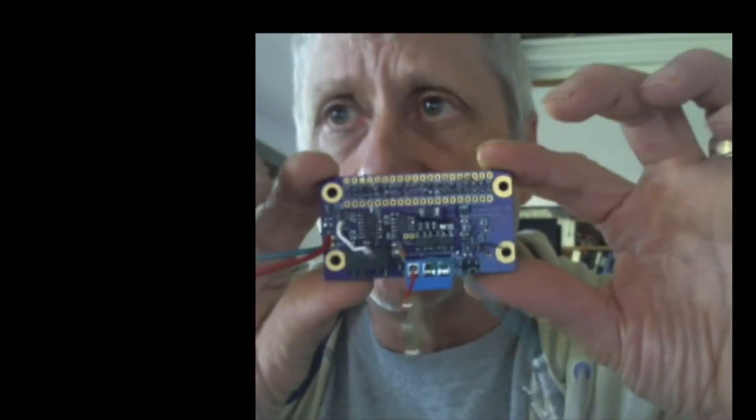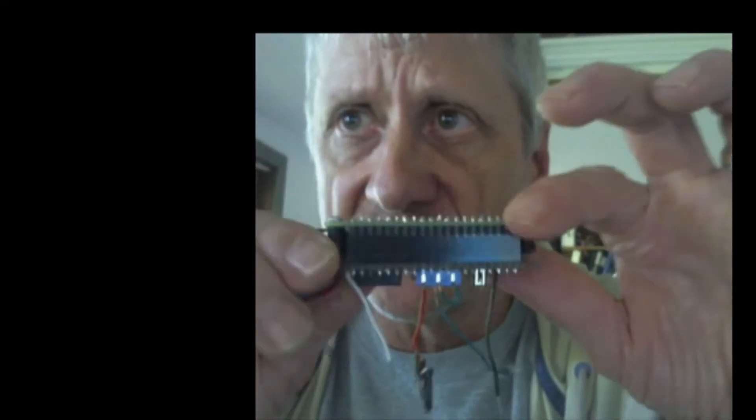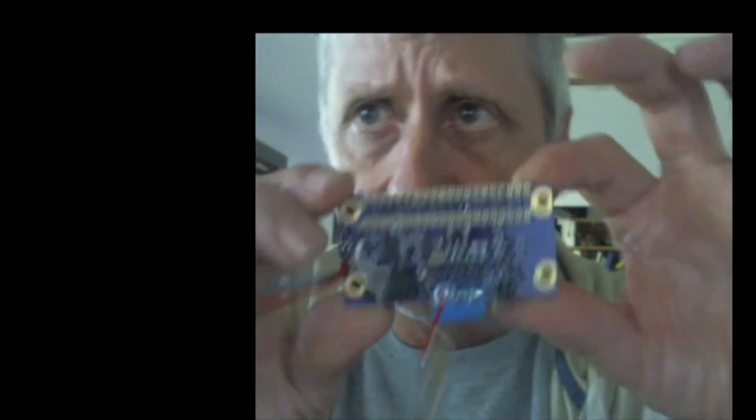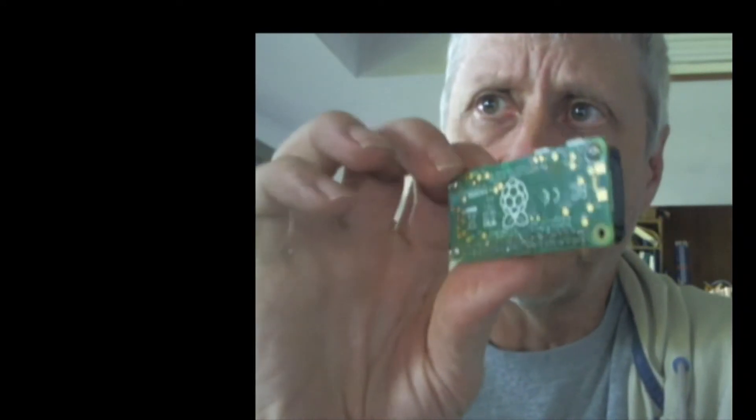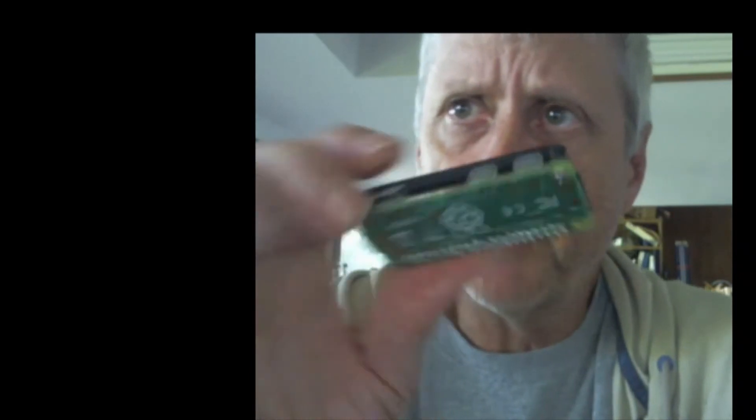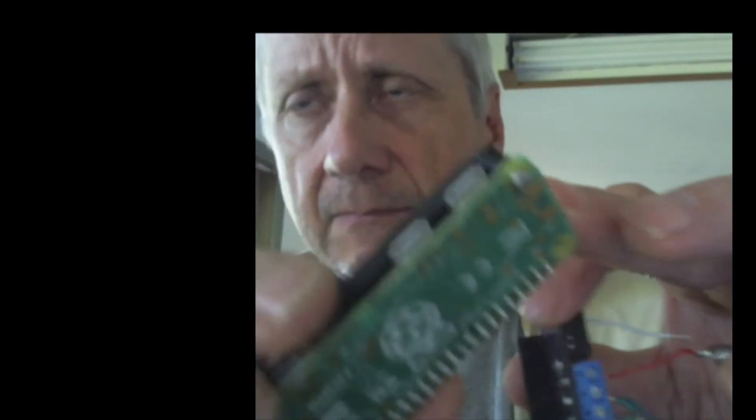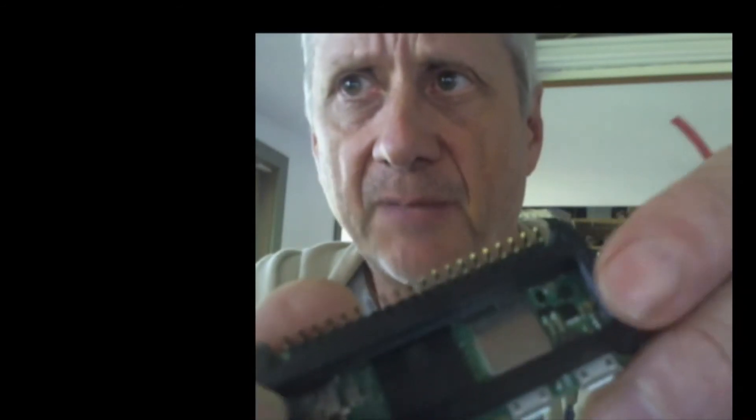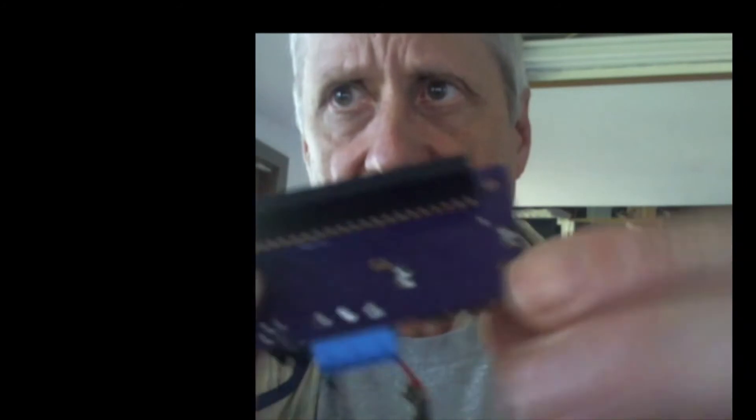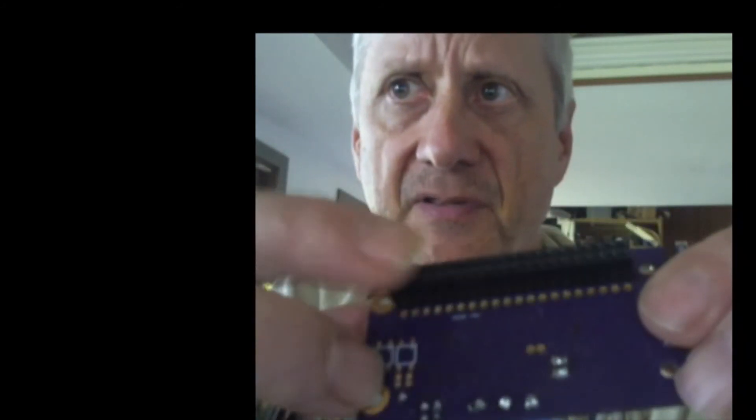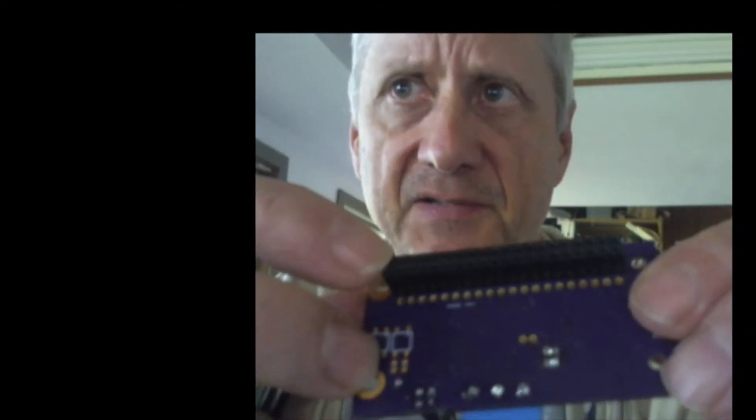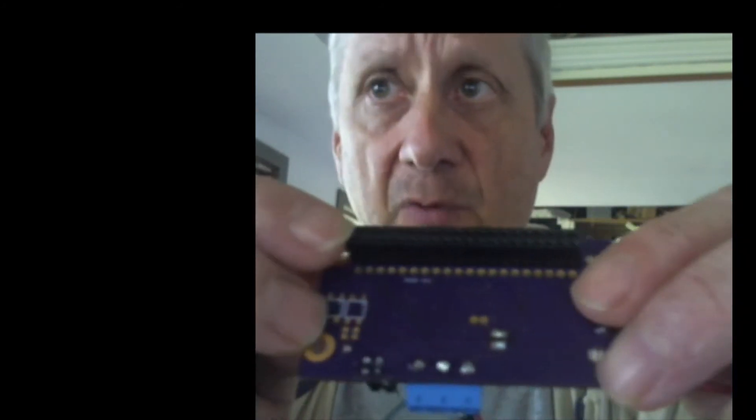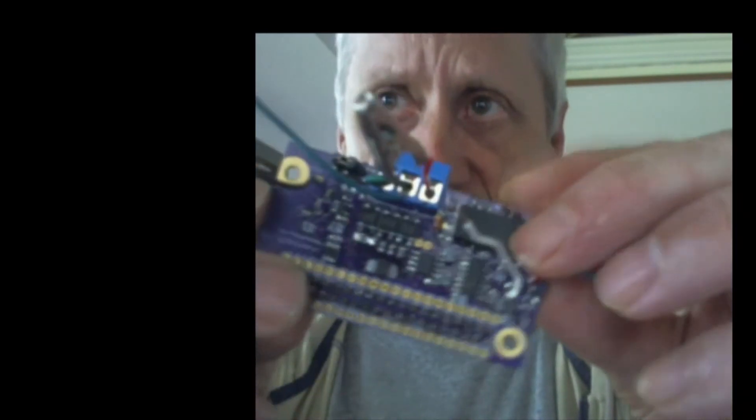So this is the electronics part of it, and it comes apart into two pieces. One piece is a standard Raspberry Pi Zero 2W development board. This one, I put a little 3D printed standoff on it, so that connects to my other board.